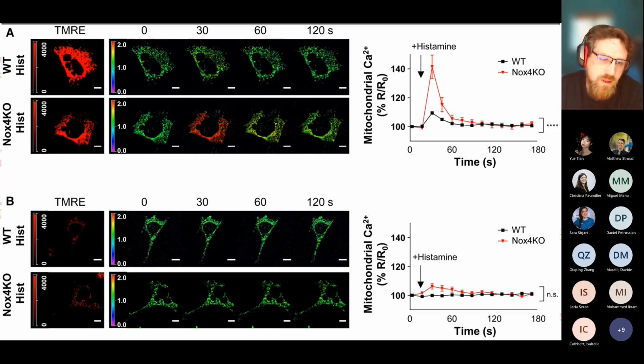So this was some work that he did a while back, and I helped him with some of the cell masking. As I mentioned before, we don't simply provide you access to the equipment. We'll also give you input on how to take the images. Our training is usually bespoke for every researcher, but also for the analysis side of things, if you've got queries on how to perform something like cell masking and then ratiometric analysis, these are things that we can provide you input on.